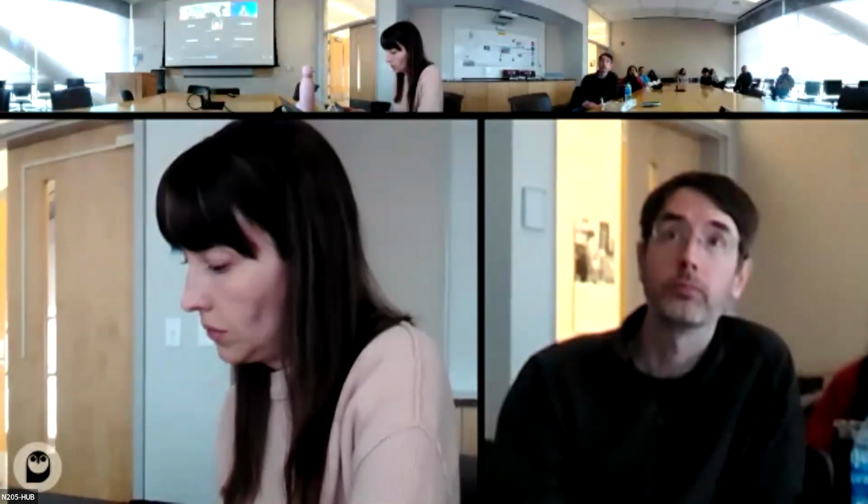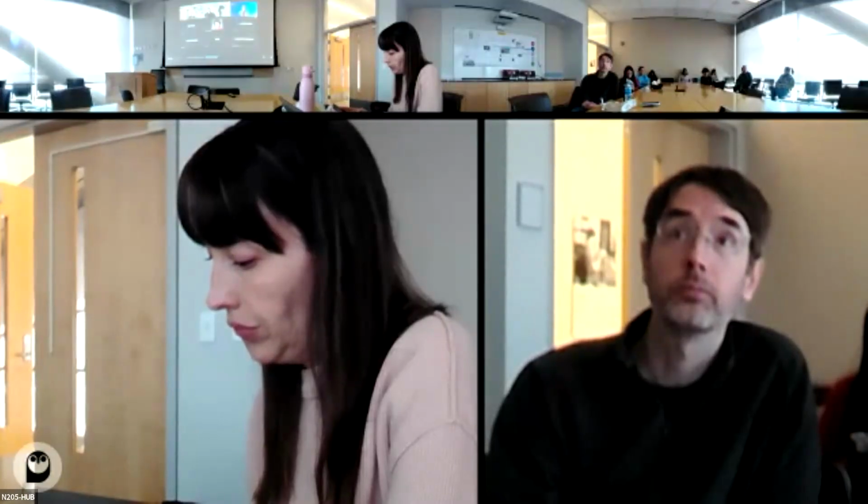It's very clear that in this two-layer situation, we have a completely intact cover layer, but we do have something which electronically changes the game beneath that particular defect. So geometrically, there is something below that defect. And our current interpretation is that it is a selenium cluster. Would I put my hand into the fire for that? Probably.